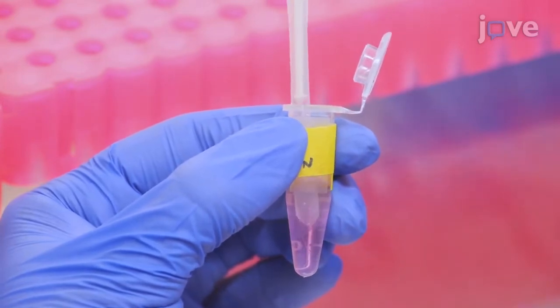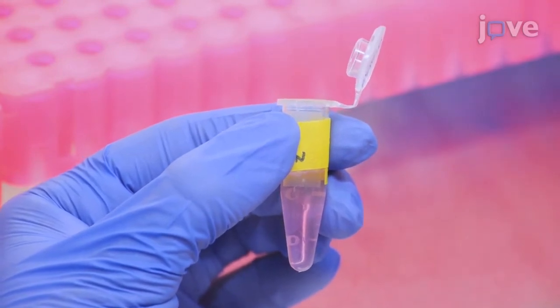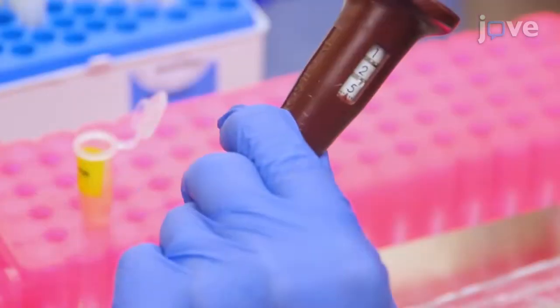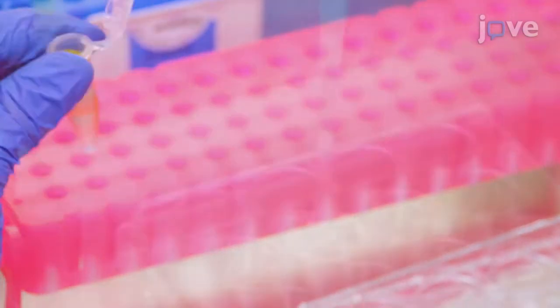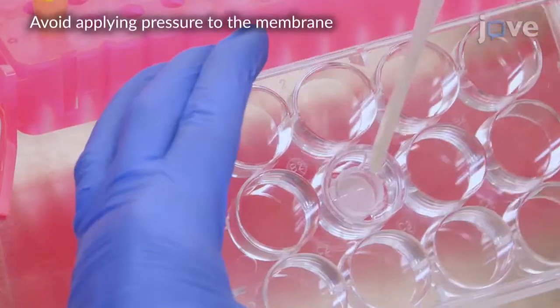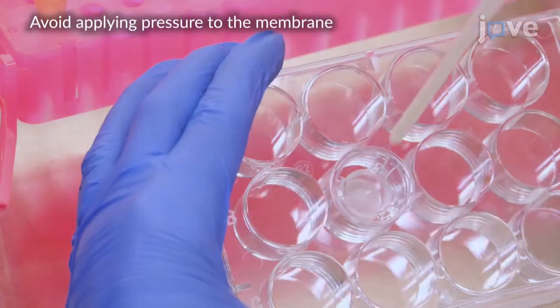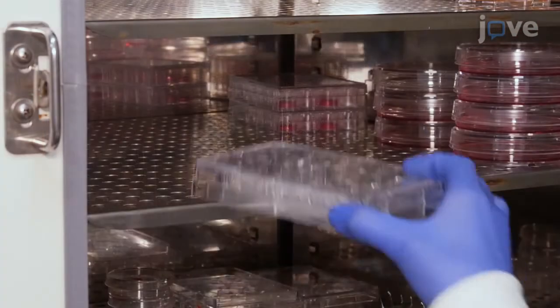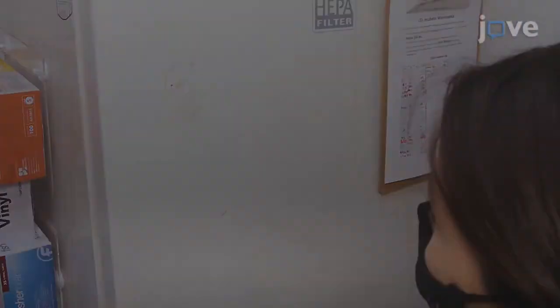Mix uniformly from different positions of the tube until the solution is of homogeneous color, which typically takes about 5 pipette cycles or 10 seconds. Immediately disperse 125 microliters of acellular collagen onto the membrane of the 12-well culture insert. To ensure uniform coverage, tilt the plate and use the pipette tip to paint the membrane by gently spreading collagen around. Immediately move the 12-well plate to a 37 degrees Celsius cell culture incubator to let it gel for at least 20 minutes.